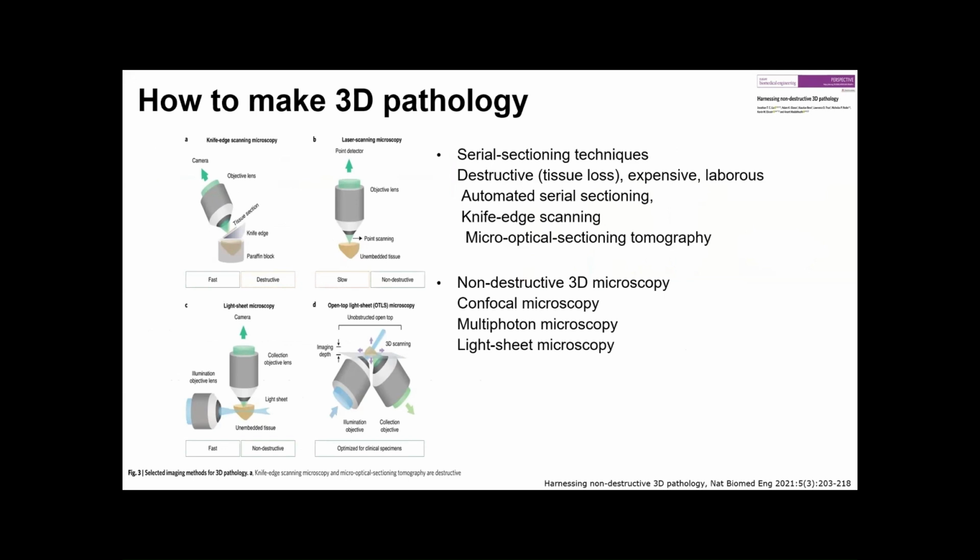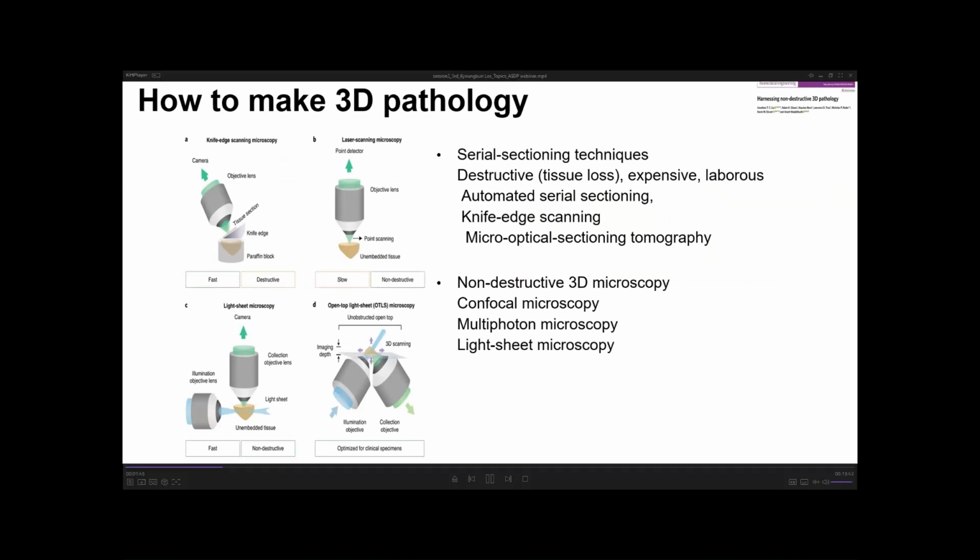The second one is non-destructive 3D microscopy. Confocal microscopy, multiphoton microscopy, and light sheet microscopy are examples of this method. Confocal and multiphoton microscopies are point scanning methods.